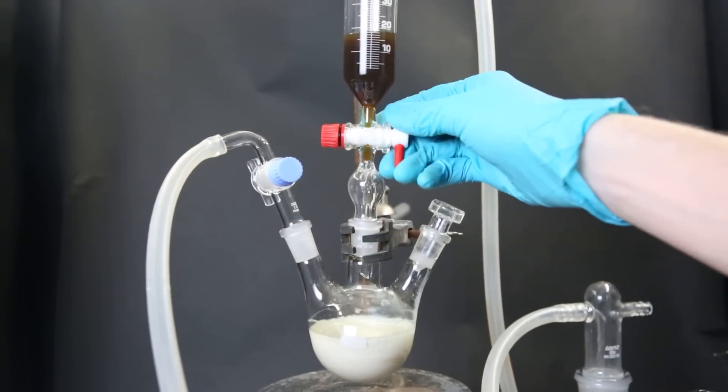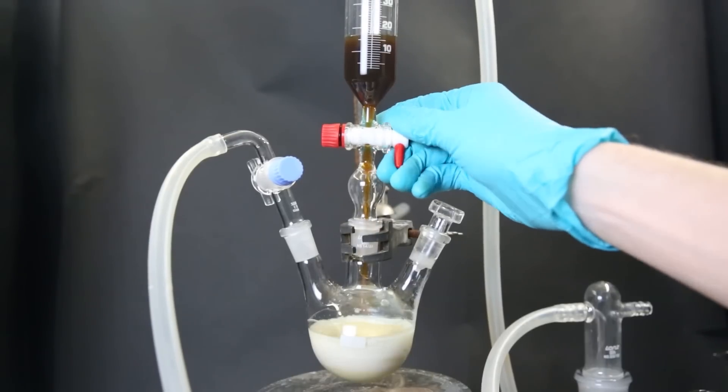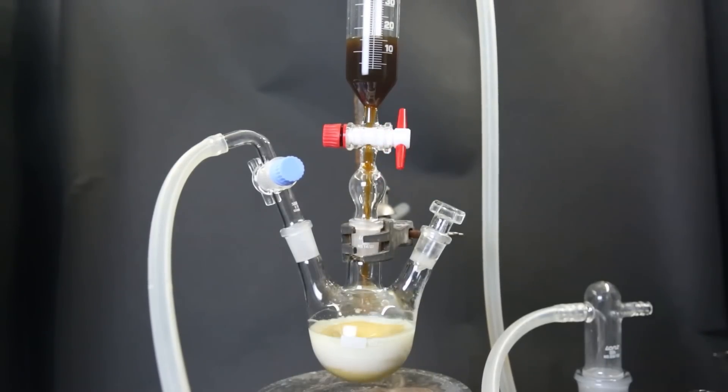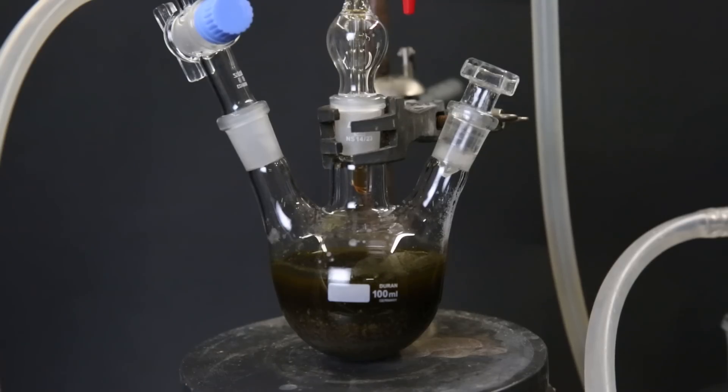I open the dropping funnel and slowly drip in the iron(II) chloride solution. The reaction mixture quickly turns orange, and after everything was added and left to stir for a while, it turned almost black.